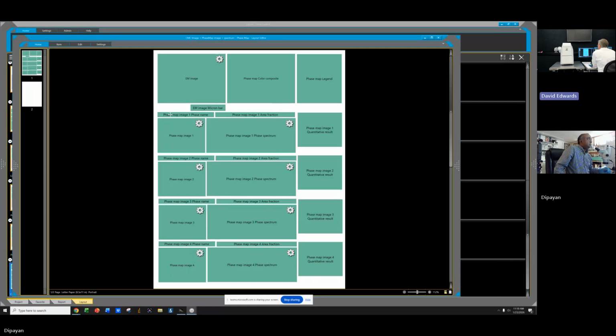Highlight everything below your upper bits. I think you can drag a box. If you get outside of that a little bit, and then good recording. You can't highlight, you have to manually highlight everything, I think, by control. Yeah. So in any case, you get all of those, and then you move them to the second page. Yeah, I can do that later. I understand.